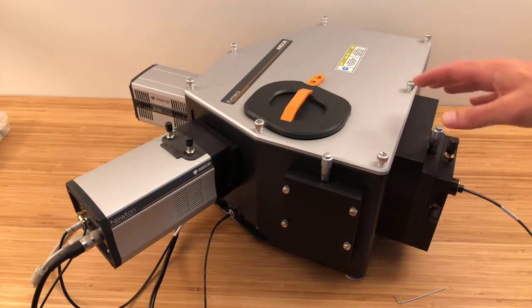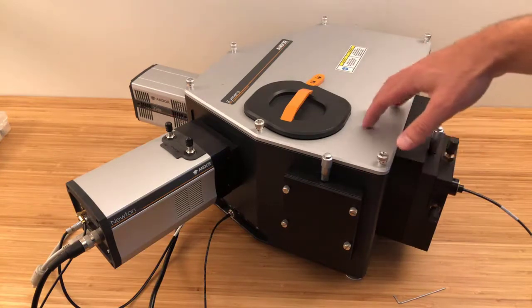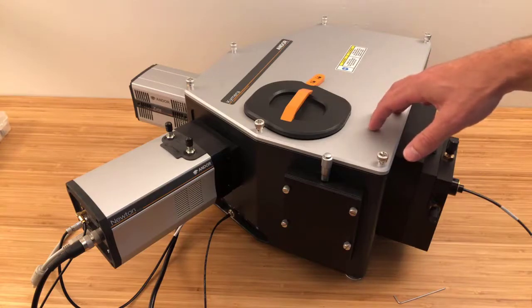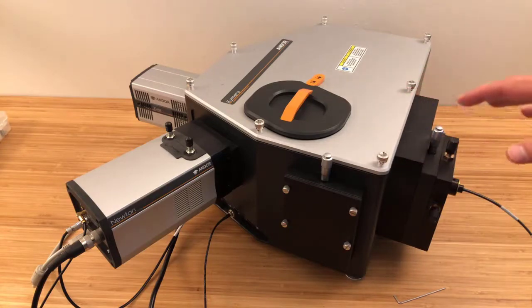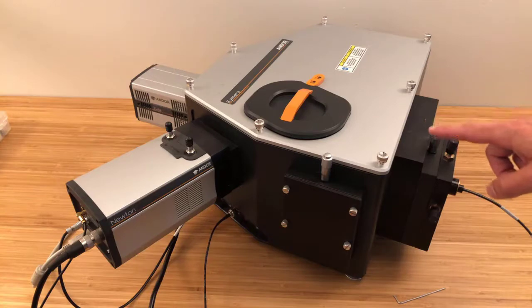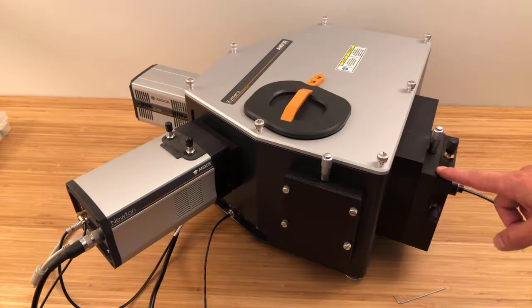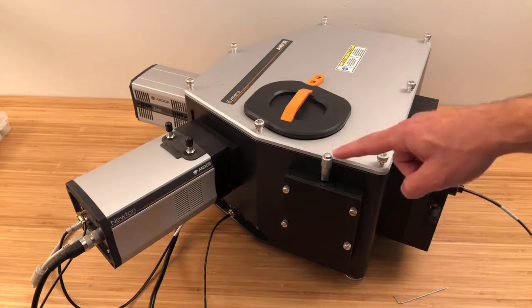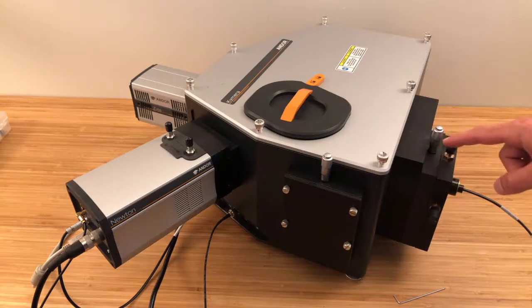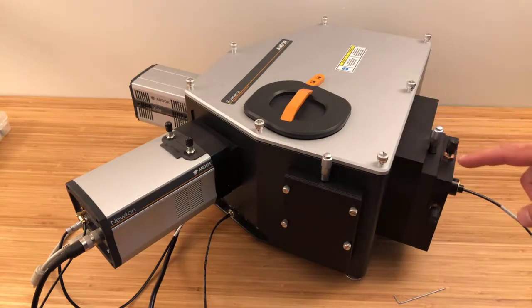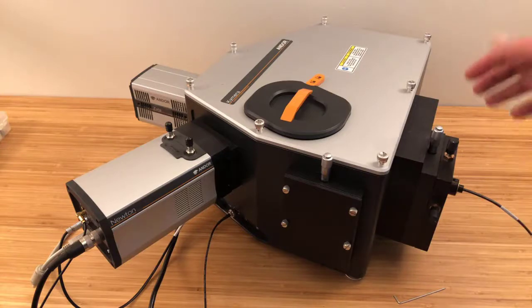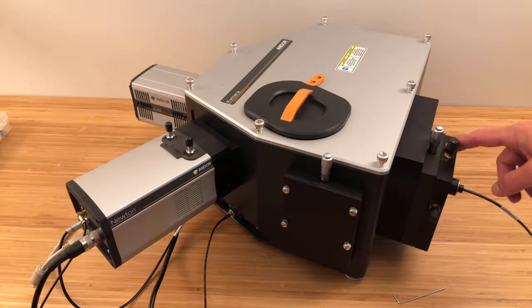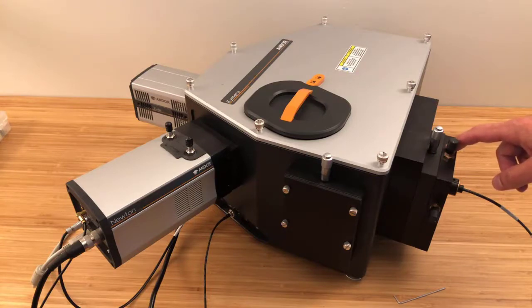Port selection is motorized and software controlled by a mirror in here that I'll show you also in a minute. I only have one of these ports in use right now, so I'm using the side port, the side input port. But both ports are equipped with manual slits. You can actually see the silver adjustment micrometers here. I only have one input accessory mounted right now, an XY adjustable fiber adapter.